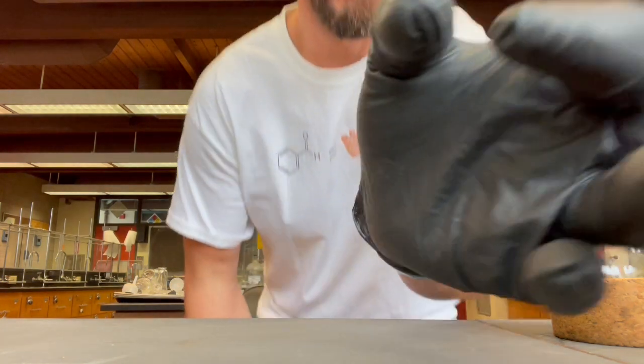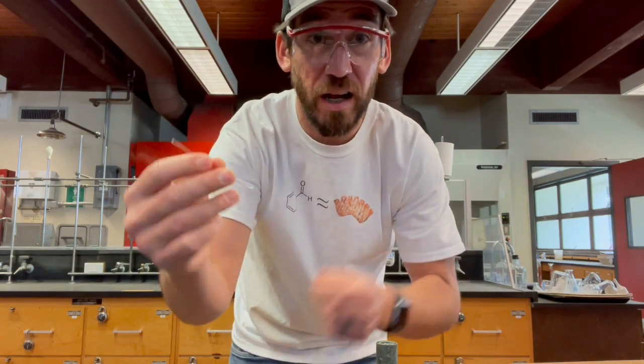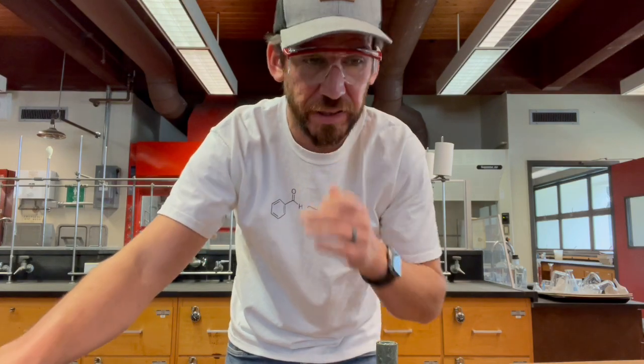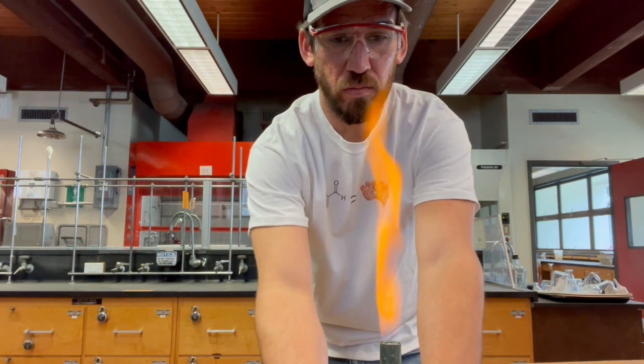Actually, I'm going to do the boiling point. So let's burn some glassware. Okay, you're in for a treat. Taking this pipette, about to burn it, stretch it out, put it inside of this melting point capillary tube. Let's see if we can do this real fast. Let's make sure we get that hot, super awesome blue flame.